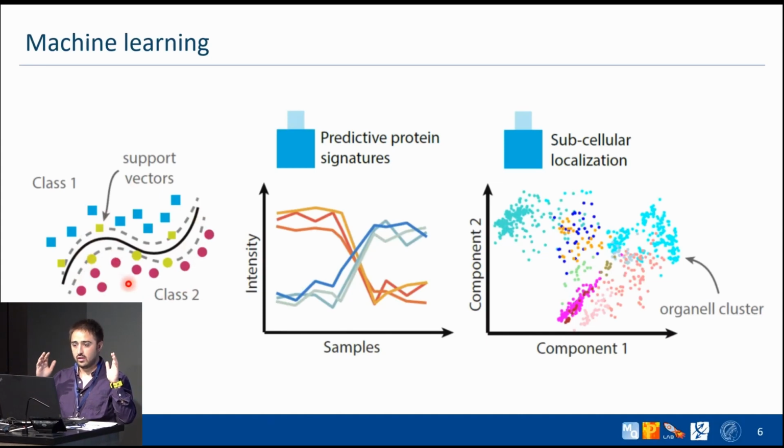You look into this black box and see which subset of proteins were more important for reaching that prediction, and then you choose 5, let's say, or 6 or 7, and you claim these proteins are markers. These are the proteins that you actually look at to really have a good diagnosis. So this will be the second use case.